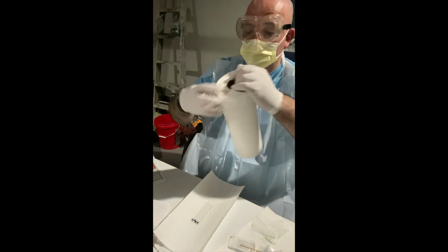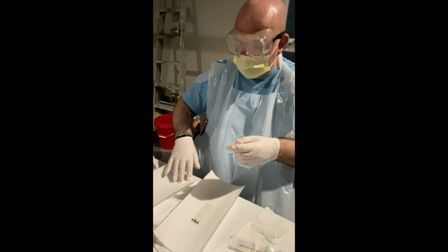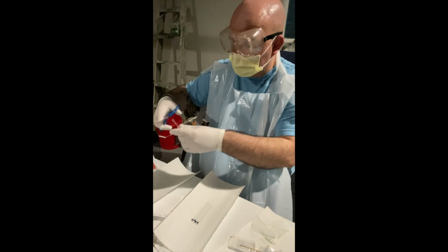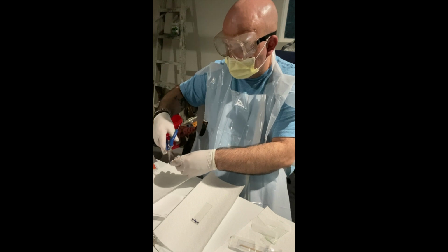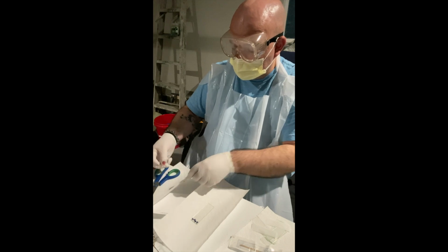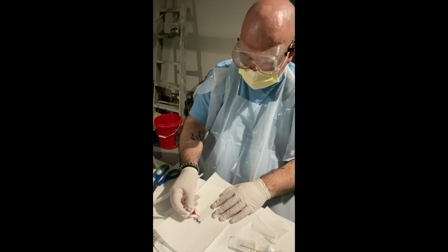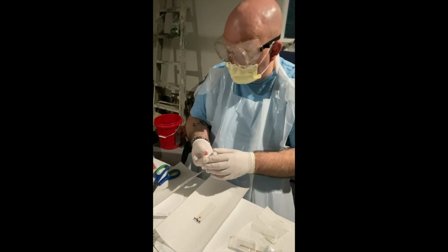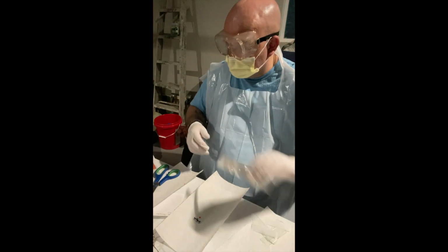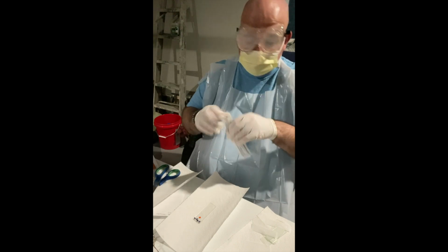Okay, so I'm going to go ahead and proceed with opening up the Congo red. Pair of scissors here. Okay, so there's a drop of the Congo red. Just going to set it to the side. So now I need my sample.